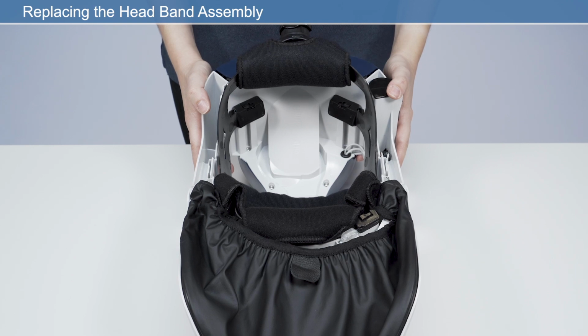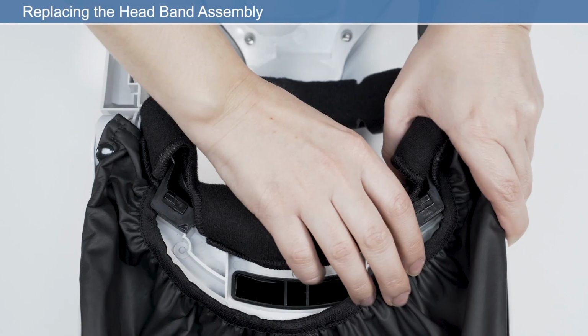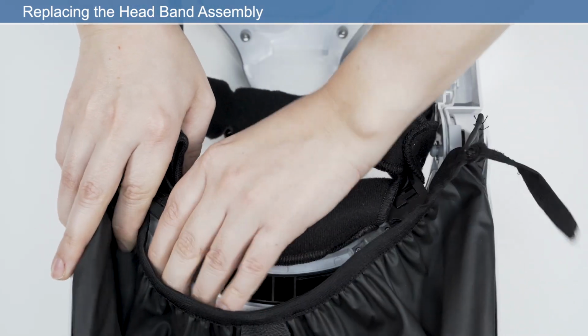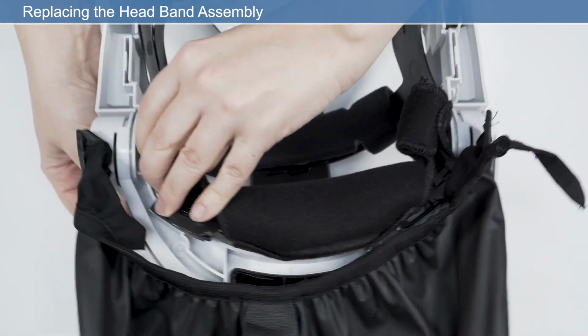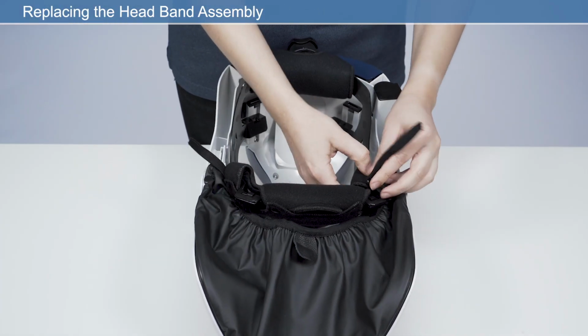To install a new headband, first remove the old headband. Start by disengaging the rear two clips. Then, lift the headband up and disengage the front two clips. Fit the new band by reattaching the 4 clips to the frame.